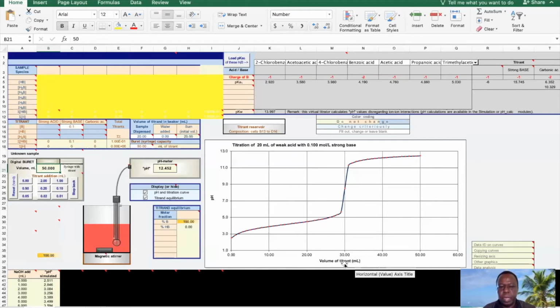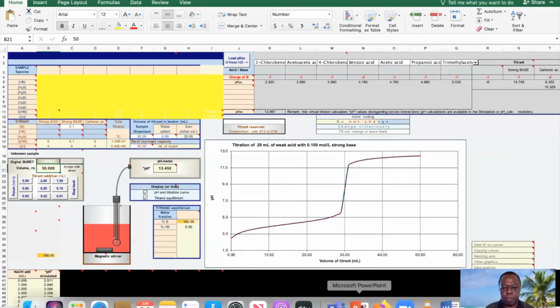Remember that. You should use at least 3/4 of the page. I don't want a really tiny graph that I can't even see the volume. You have to scale it in such a way that you don't end up with a small graph. This is one graph I will be looking at for part A. This is the graph we will be looking at.